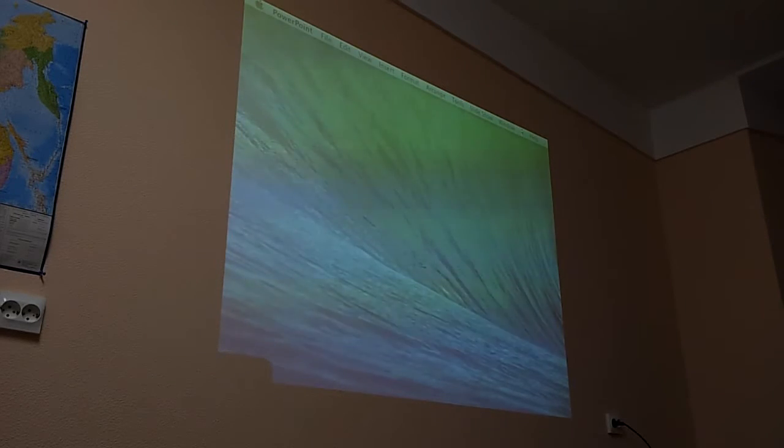So this is the kit for enrichment. This is why I thought maybe it's a good idea to speak a little bit about this procedure.